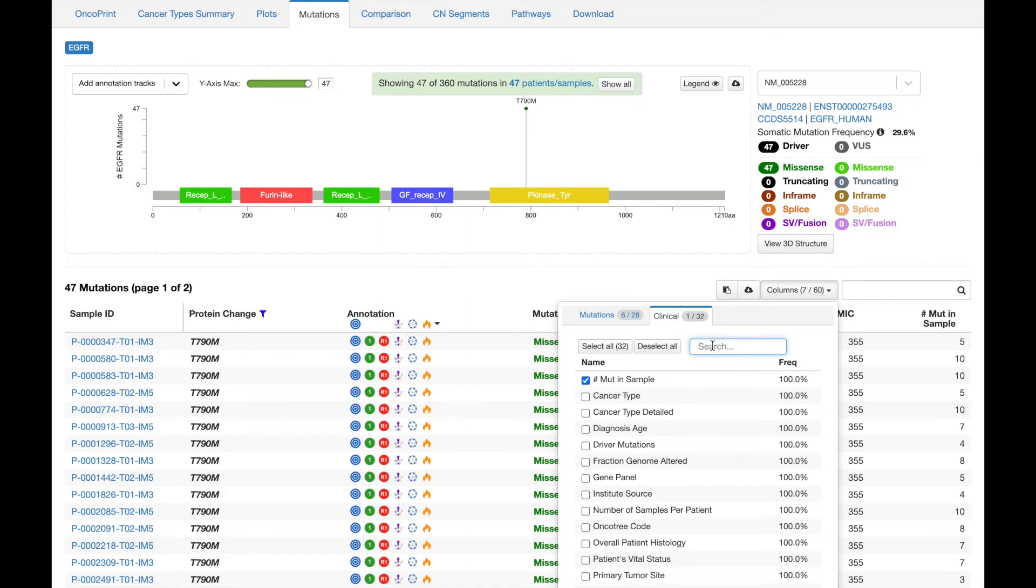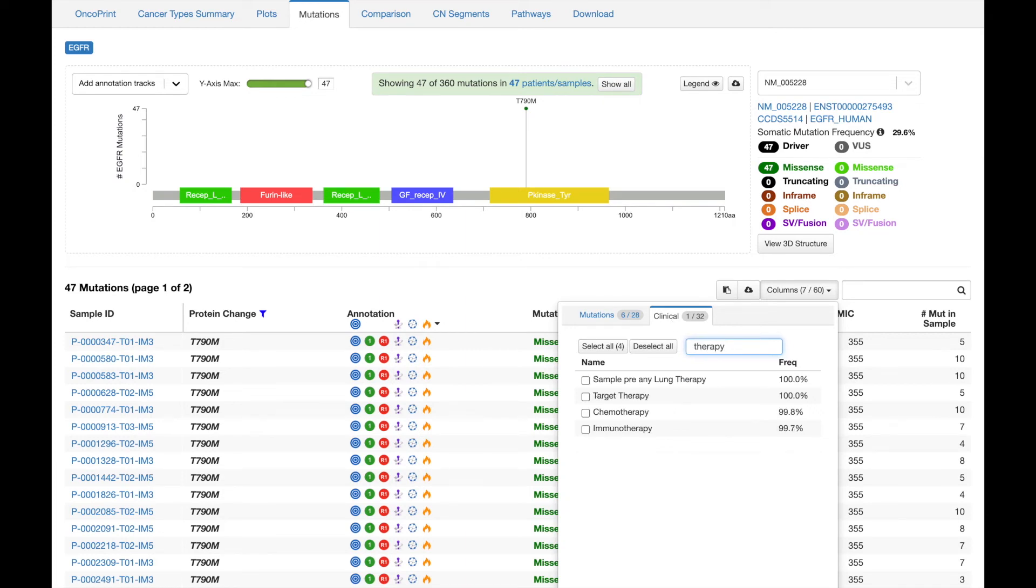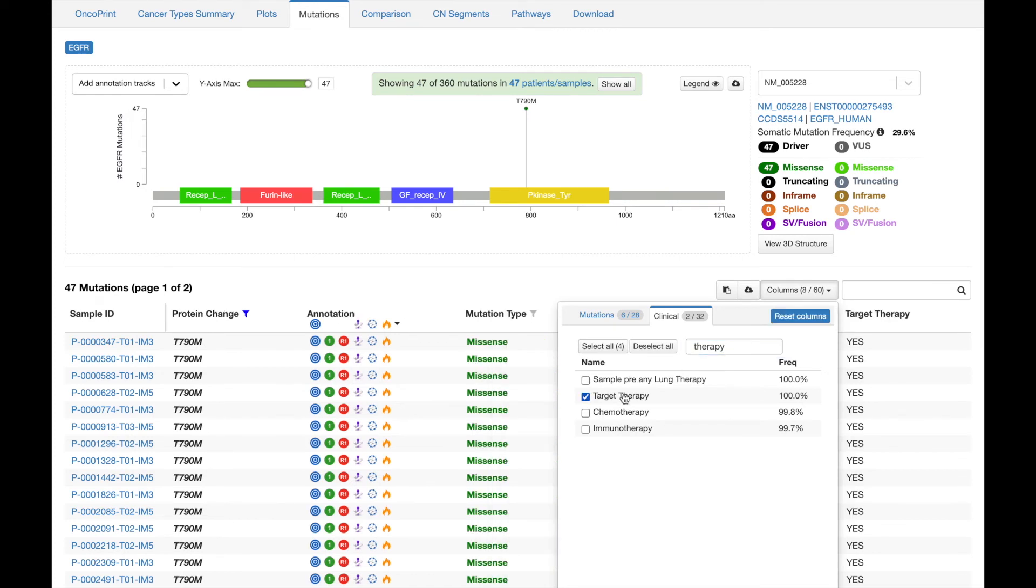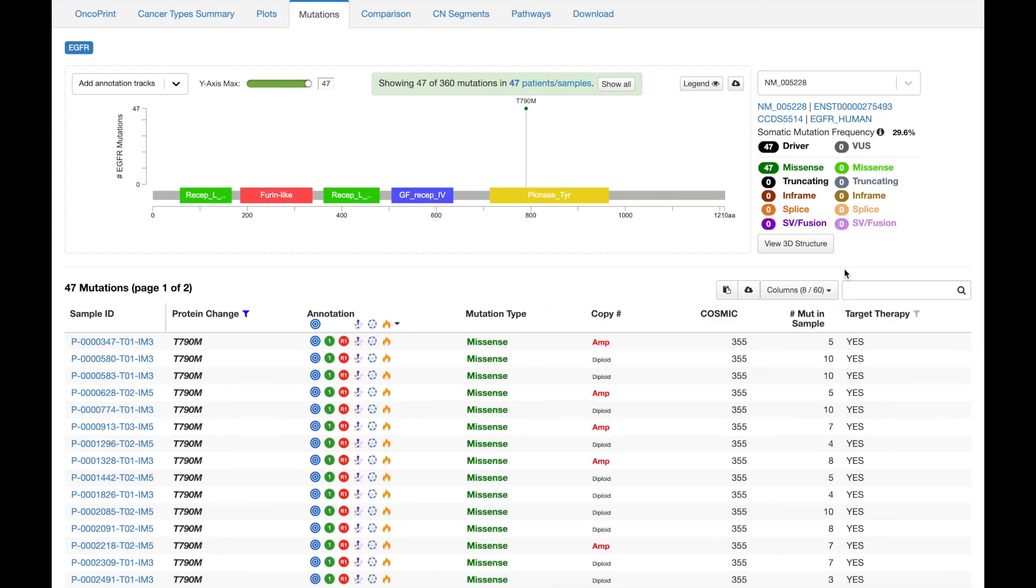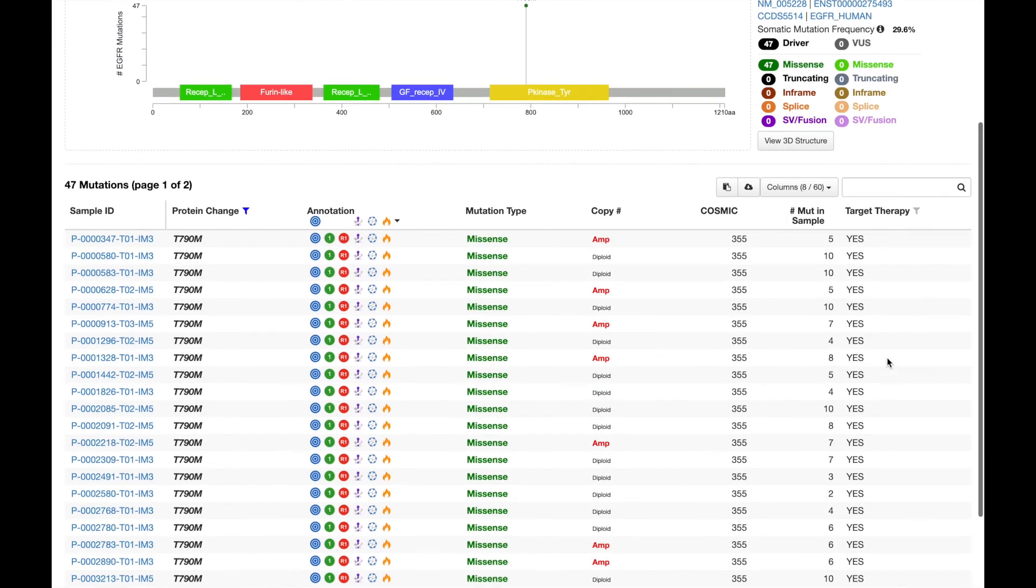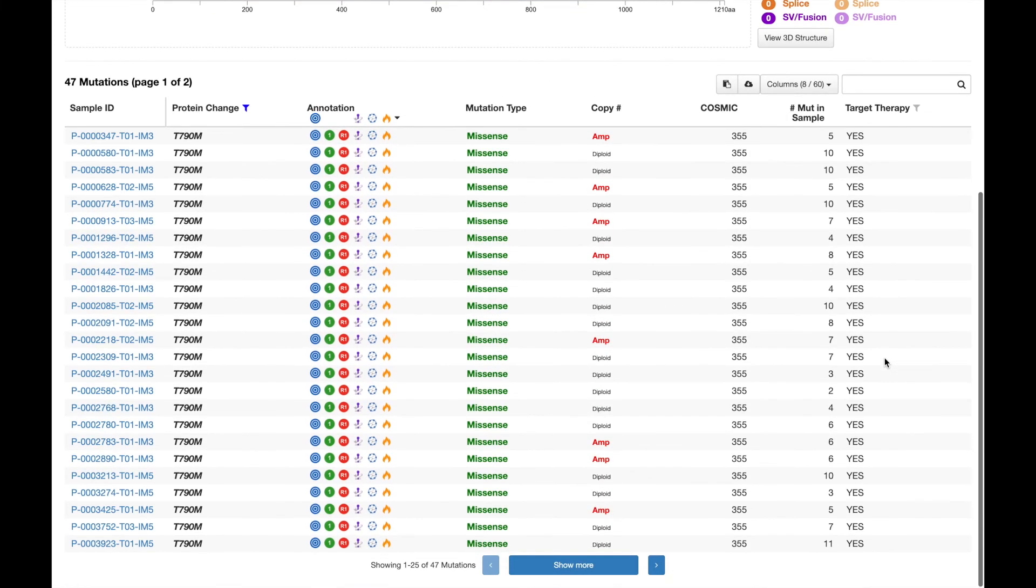So I can search to see if there are any therapy-related fields. I'll go ahead and add targeted therapy. Here's that new column added, and we can see that all the samples currently in view did receive a targeted therapy.